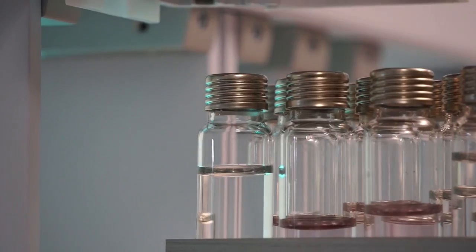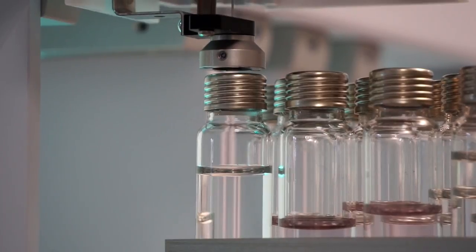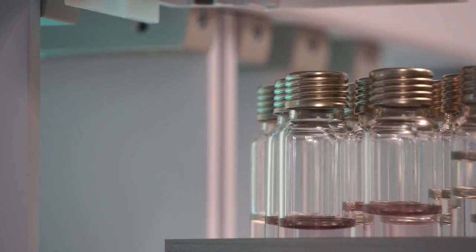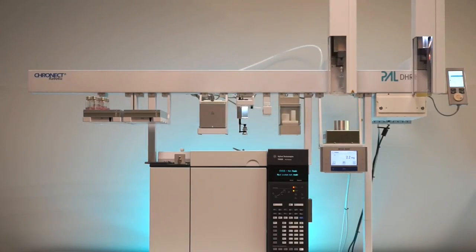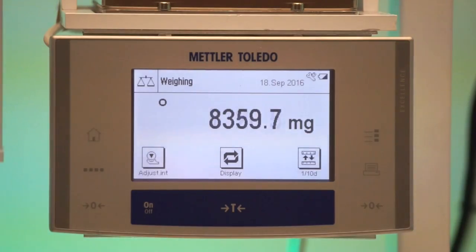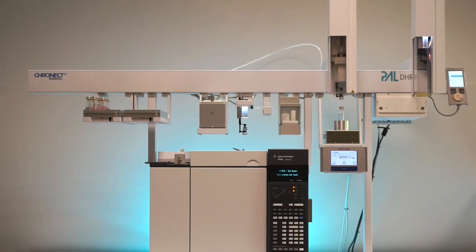The left arm of the autosampler is equipped with a changer tool for headspace injection and transports the sample inside a 20ml vial to the analytical balance. The analytical balance determines and documents the weight of the sample. The left arm transports the sample back from the analytical balance to the rack.